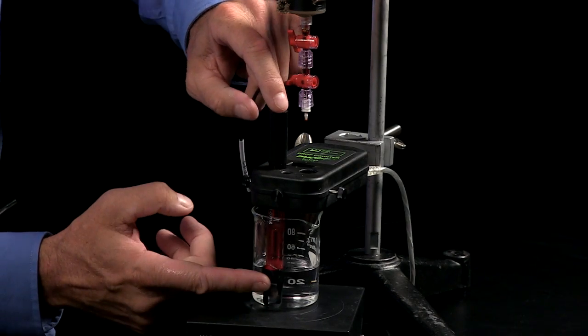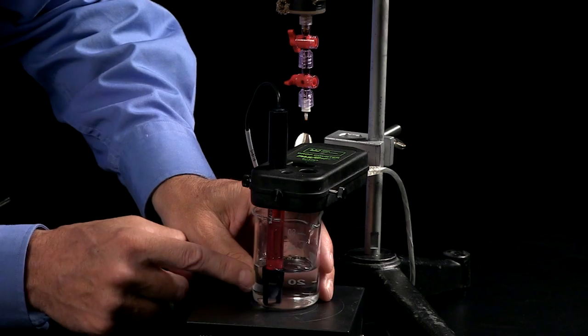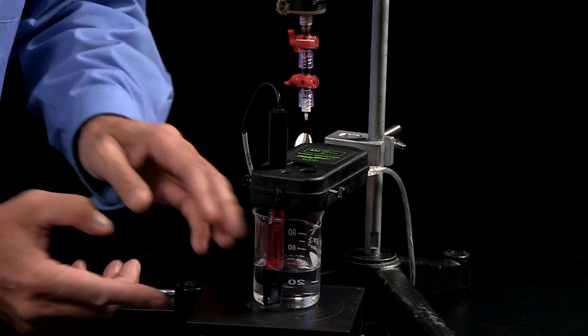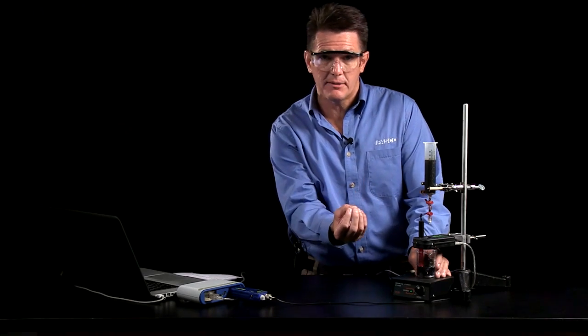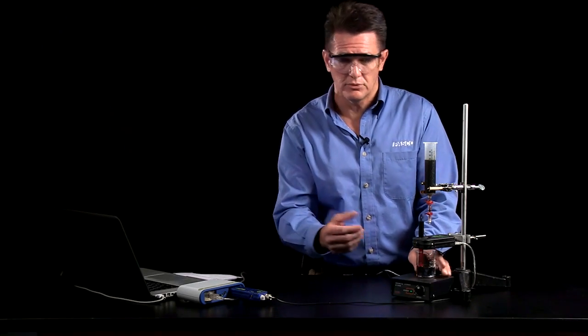This is our ORP probe that I showed you a moment ago. I installed a magnetic stirrer on the bottom of it. Be careful that your solution does cover up the bulb at the very bottom of the ORP probe, otherwise your readings would be off.